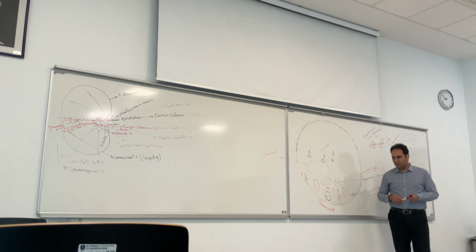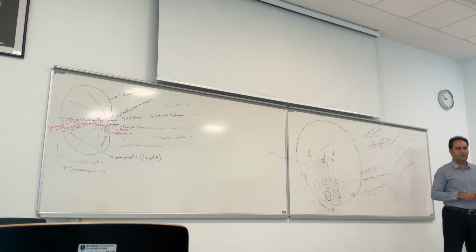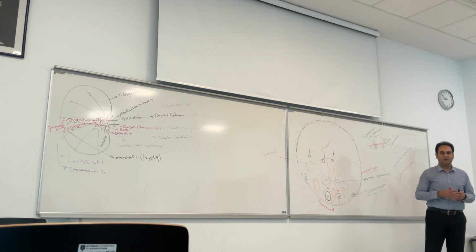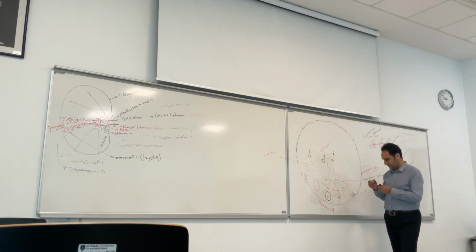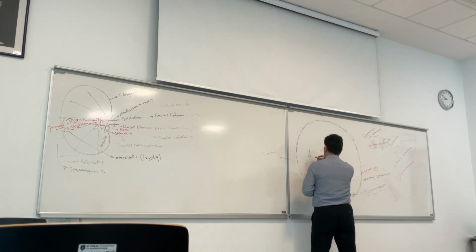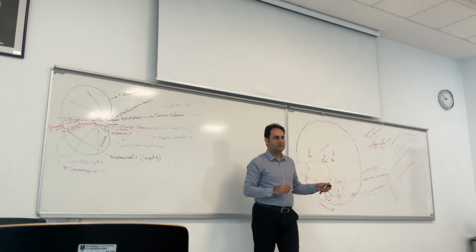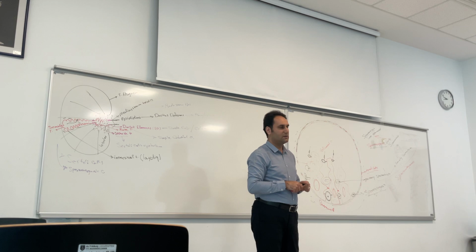Guys, the cells in the different stages of spermatogenesis, and also the spermatogonia cells, have a relation with Sertoli cells and are connected with Sertoli cells in different stages, with connexins, okay? And the Sertoli cells support these spermatogenic cells. How can the Sertoli cells support these cells? What do you think?